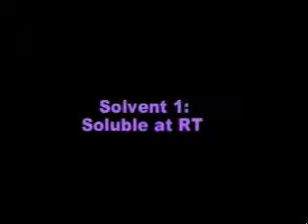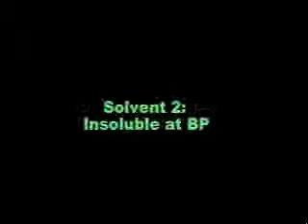When one ideal solvent cannot be found for a crystallization, it is possible to use a mixture of two solvents. Once again, you must choose the solvents very carefully. In the first solvent, solvent 1, your sample should be soluble, even at room temperature. And in the second solvent, solvent 2, your sample must remain insoluble even at the boiling point. The two solvents must also be miscible at all ratios so that they don't separate out into different layers during the recrystallization.